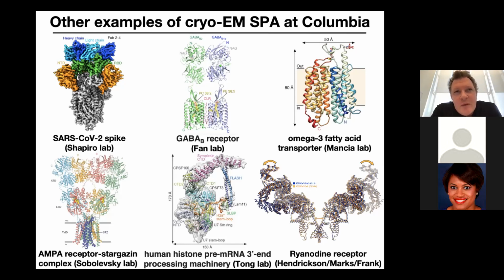But I think the big gains will be made in tomography because it's so dense. You have so many proteins in these cellular tomograms. Getting any additional contrast will help you to identify the non-obvious objects. So in some of my tomograms, you see microtubules, you see ribosomes, you see vesicles, but what you really are interested in looking at is the non-obvious protein complexes and what they're doing. And to do that, you will need better contrast.